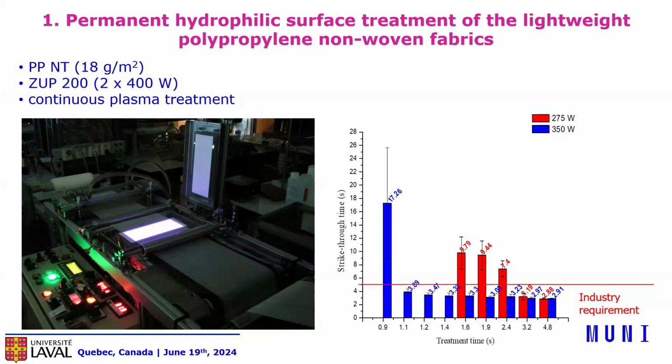If you have the hole and the bottom are two electrodes, and there is still salty water, the circuit is closed and you are measuring the time immediately. When it all goes through the textile, the instrument is switched off. And this is the standard method, which is normally used in the industry. When you are talking to a company, this is what they are mainly interested in.